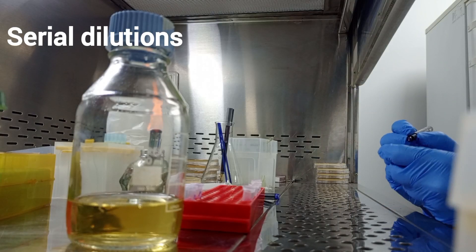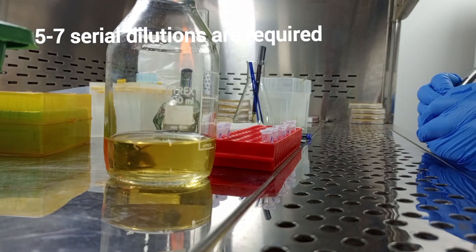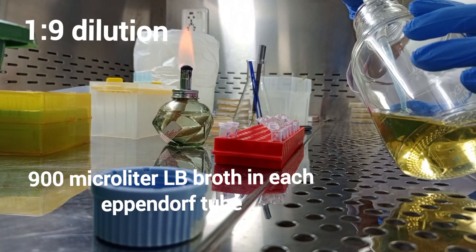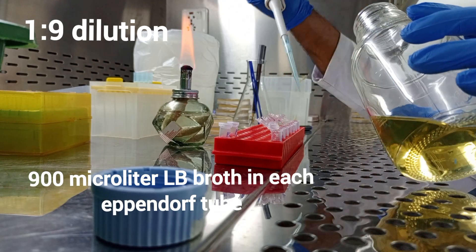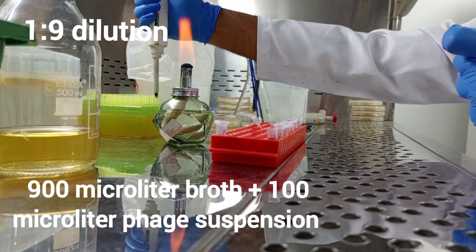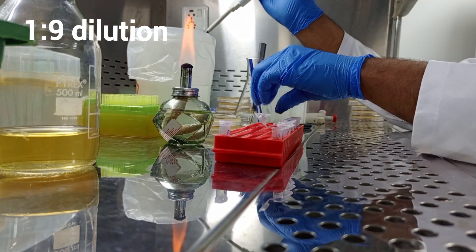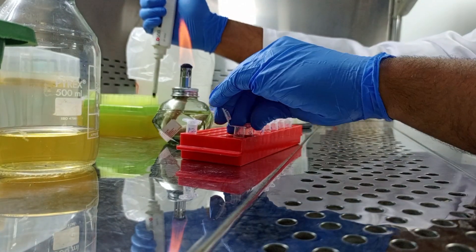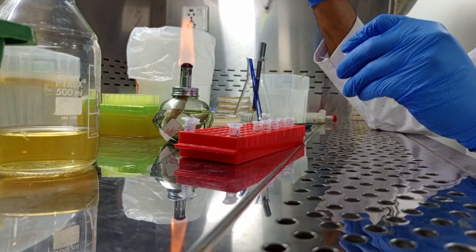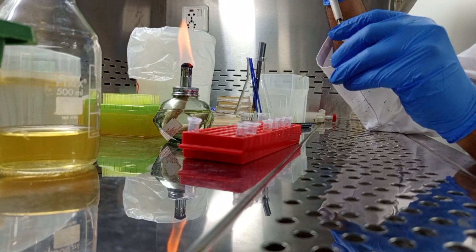Next, we have to make serial dilutions for this purified phage suspension. Five to seven dilutions are to be prepared for each phage. Take eppendorf tubes and add 900 µl of 1x LB broth in each. Take 100 µl of purified phage suspension and add it to the first eppendorf. Mix well, then take 100 µl from this eppendorf and add it to the next one. Mix well and continue this process until the last tube.